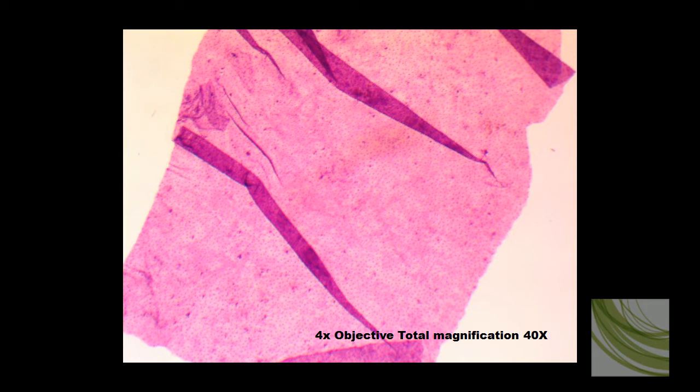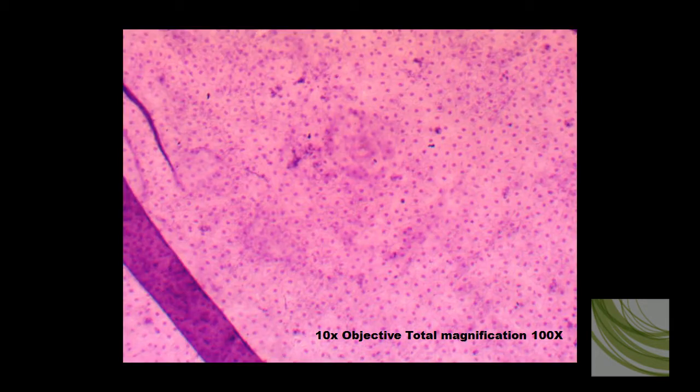This is frog skin, so that we can get a top-down view of a single layer of squamous epithelial tissue. This is using the 4x objective for a total magnification of 40 times. You can't see a lot at the 4x, but when we take it to the 10x objective, now we can start seeing the various cells.